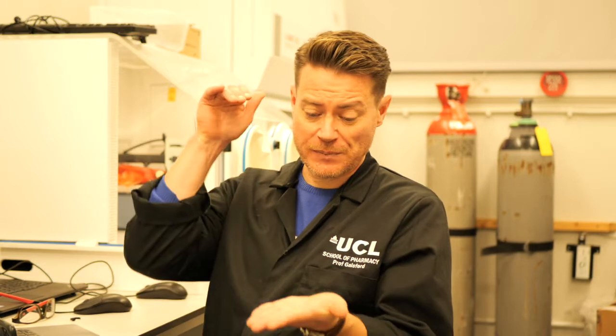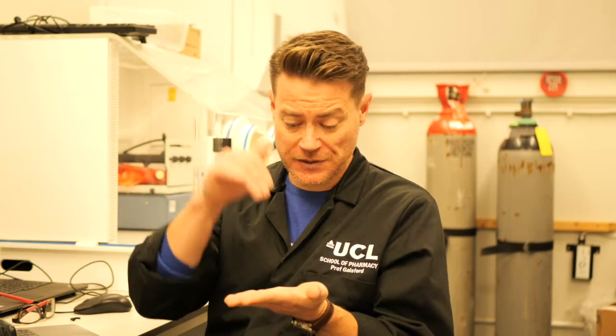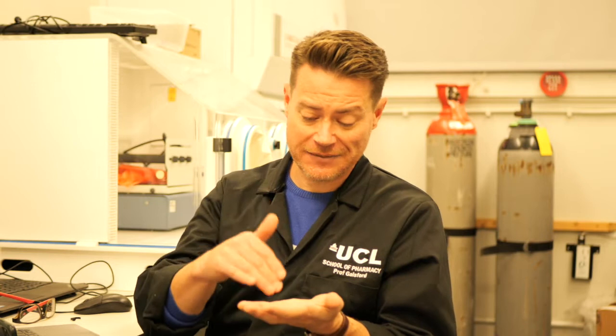And that's achieved with sputter coating, because it's literally depositing gold atom by atom to cover up the surface of your material. When you image the material then, the electron beam comes down and it bounces off the surface because it's hitting the large gold atoms and doesn't have a chance to get to your sample and destroy it. Okay? It's really important when you look at an image that's been made with a scanning electron microscope to remember that you're not actually looking at the surface of the material directly. You're looking at the surface of that material covered in heavy metal. Okay? Kind of important to keep that in mind.